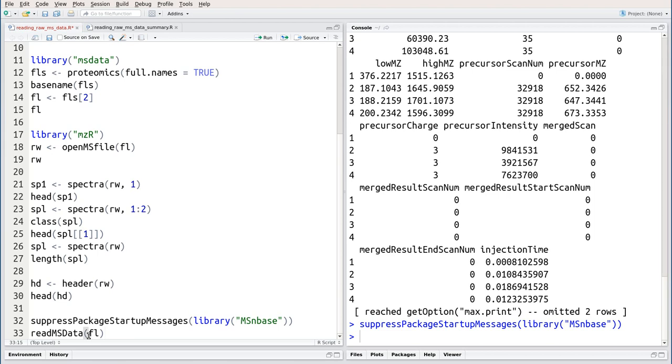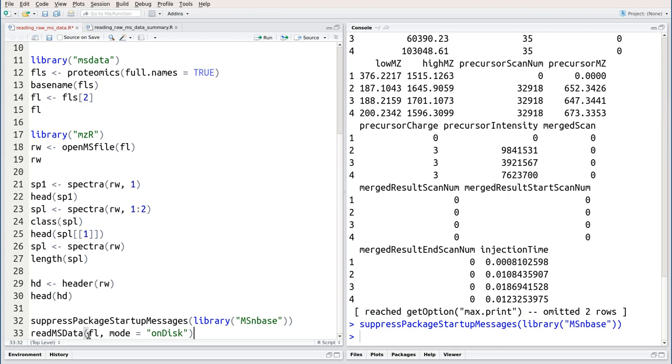Like OpenMS file, readmsdata takes as input the path to one or multiple raw mass spectrometry files. OpenMS file only supports a single file; readmsdata supports as many files as you want. We're going to set the mode argument to on disk, so that we don't load any data into memory, which can become very time consuming for big files or multiple files. We keep the data on disk and only access it when we actually need it.